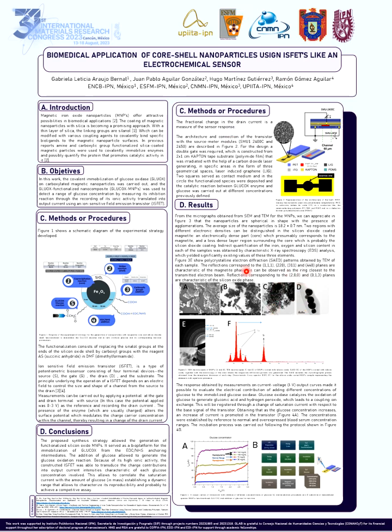In the microscopy image named with the letter C, we can observe the silica-coated magnetite, and we can see two regions with different electron densities. We can distinguish an electron-dense core, presumably corresponding to magnetite, and the less dense region surrounding the core, likely the silica shell.